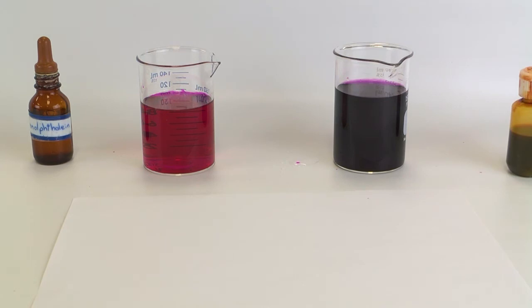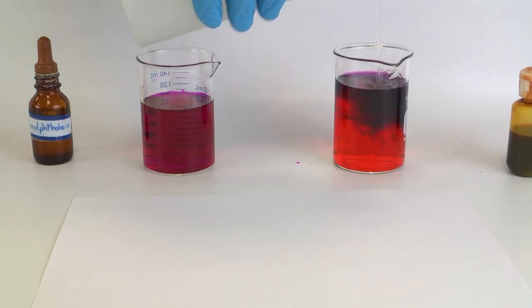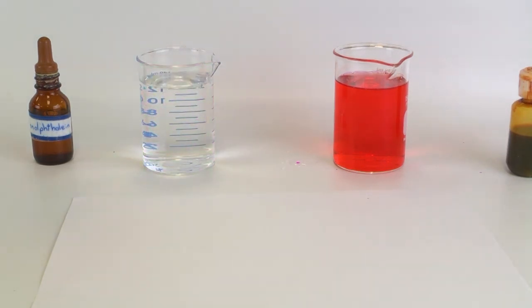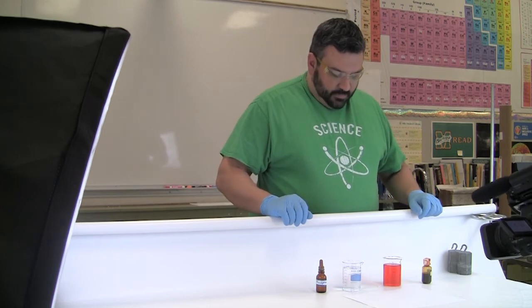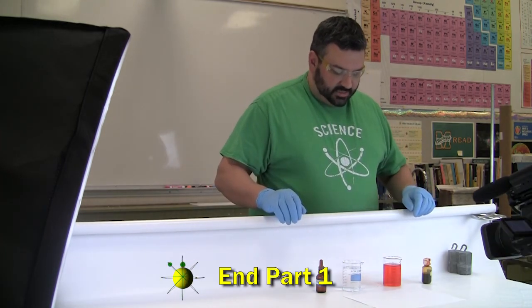So just to show that these can change back, I'll toss a little more acid in each, and it changes back. Toss a little more acid here, and it changes back. So they just indicate whether it's an acidic solution or an alkaline solution. And that's how we can see the difference between an alkaline and an acidic solution.